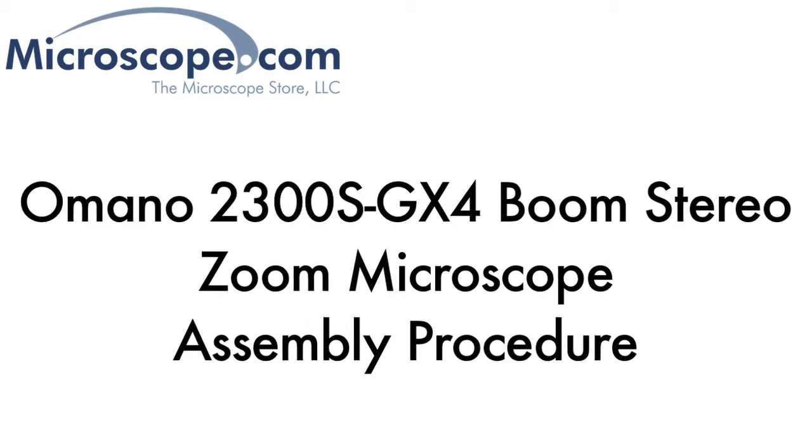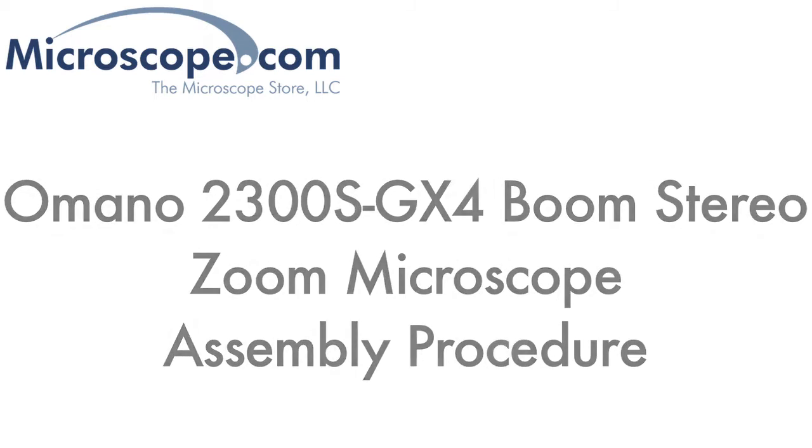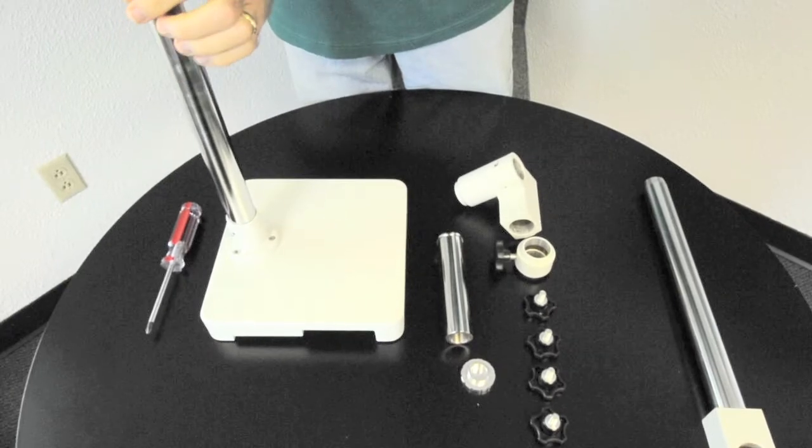This video will show you the assembly procedure for the Omano OM2300S GX4 boom stereoscope system. The boom system has only a few major parts.